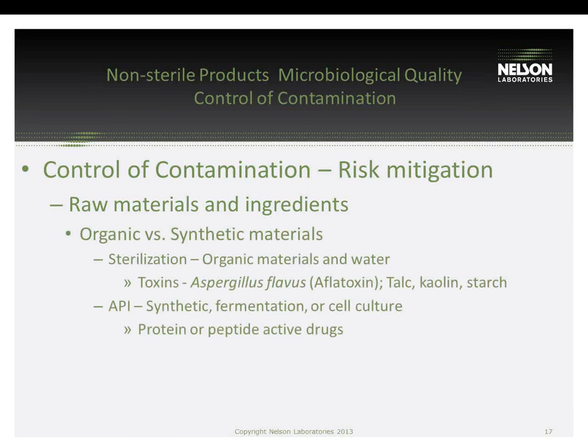As we saw with the oral dose products, organic materials are going to have a much higher risk than using synthetic materials. Through control, sterilization may be appropriate for water or those organic materials before they're put in the product, even for non-sterile products, depending on what the material is.